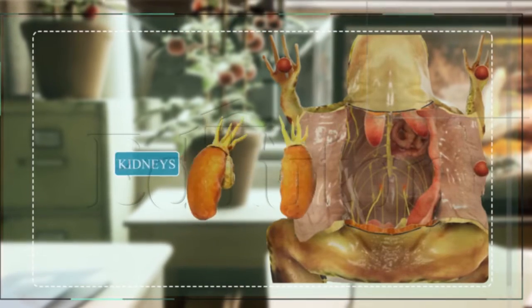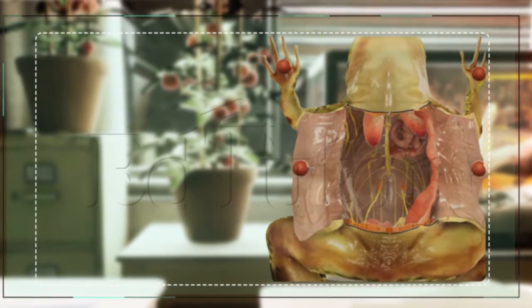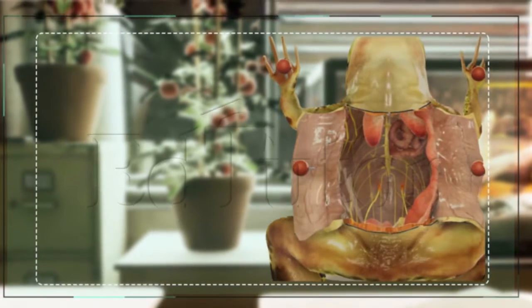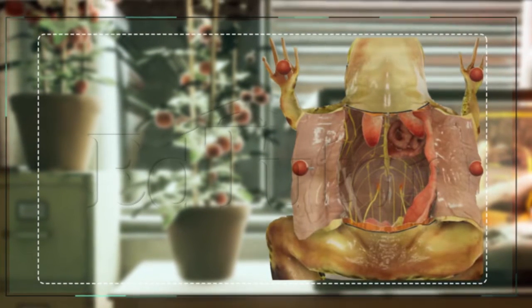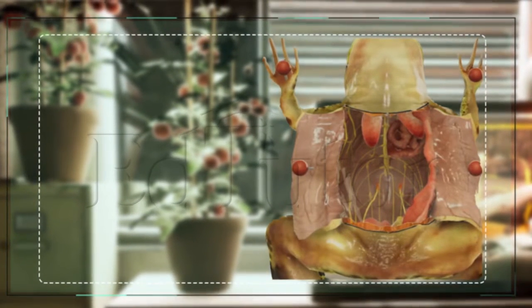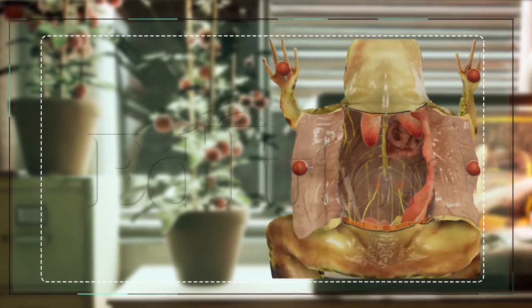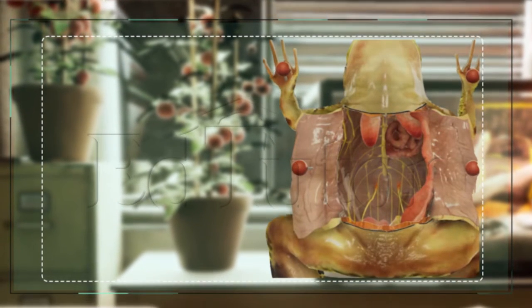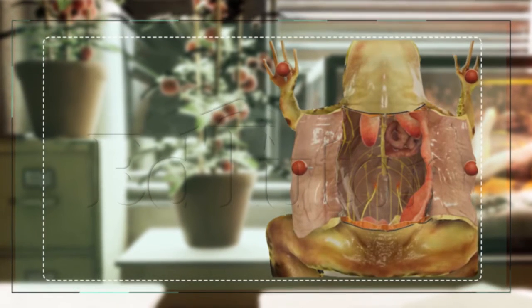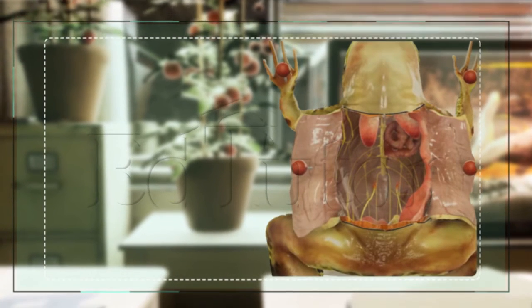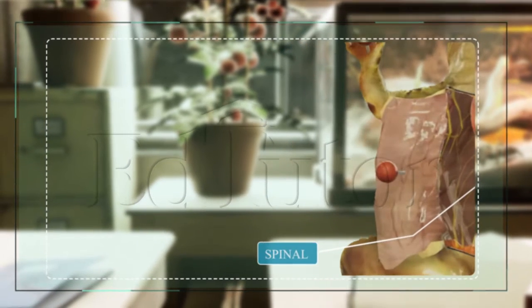We will remove the kidneys right here. When we remove the kidneys, we see the thread-like network of spinal nerves that I mentioned in the beginning to you.